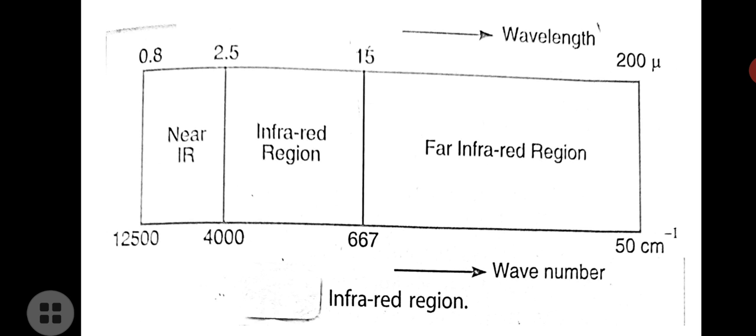In terms of wave number also, you can see the infrared region covers 4000 centimeter inverse to 667 centimeter inverse.